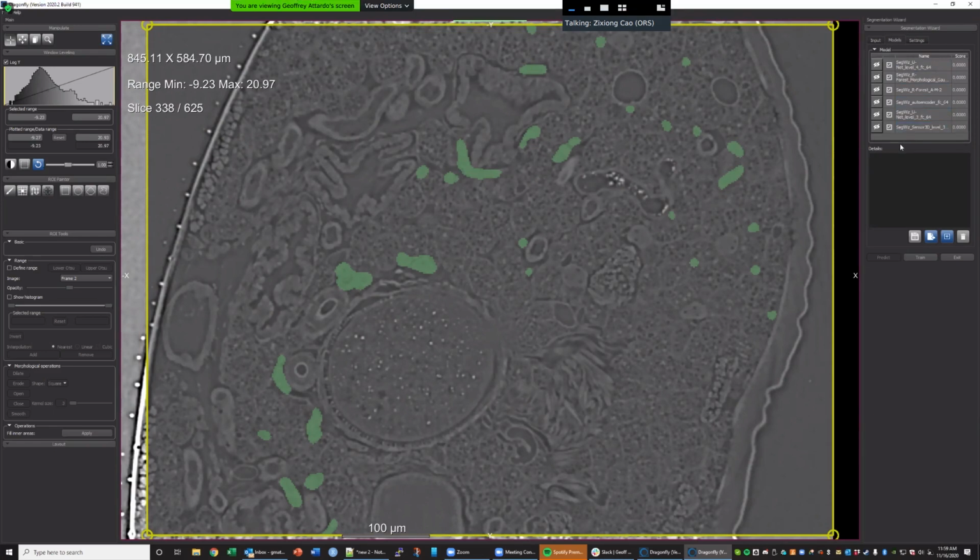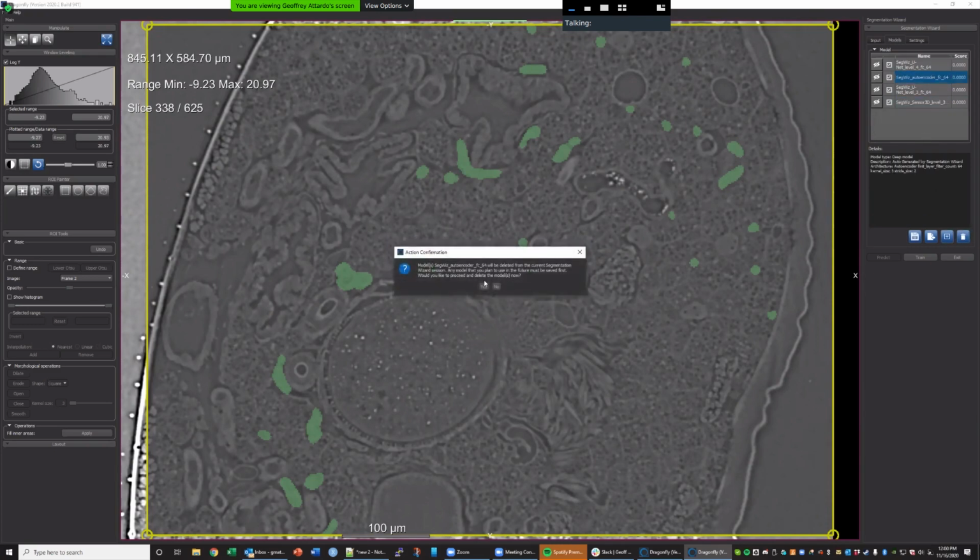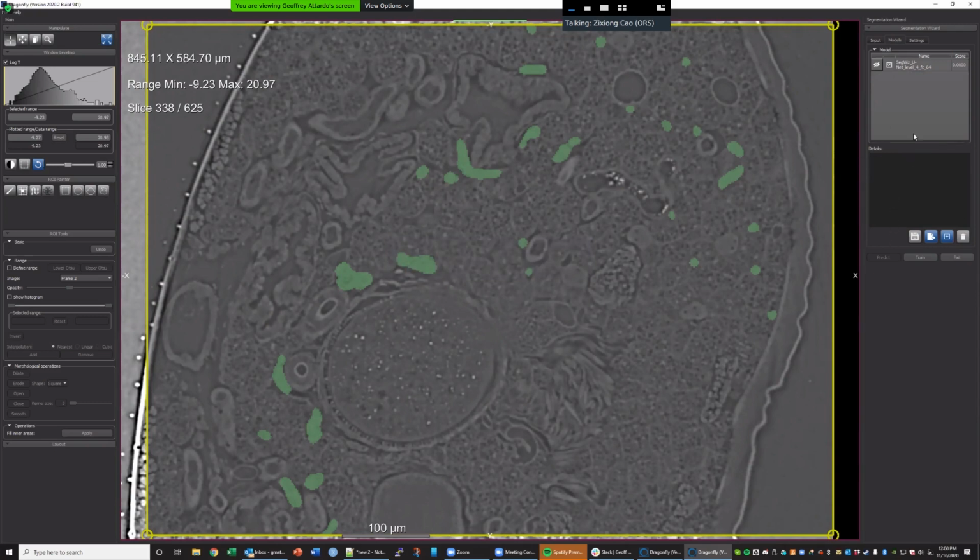As I said, there are many models automatically generated or suggested by the application, by the wizard itself. So we don't need all of them. We keep the first one and we delete all the others. Okay. I think we are ready to train.